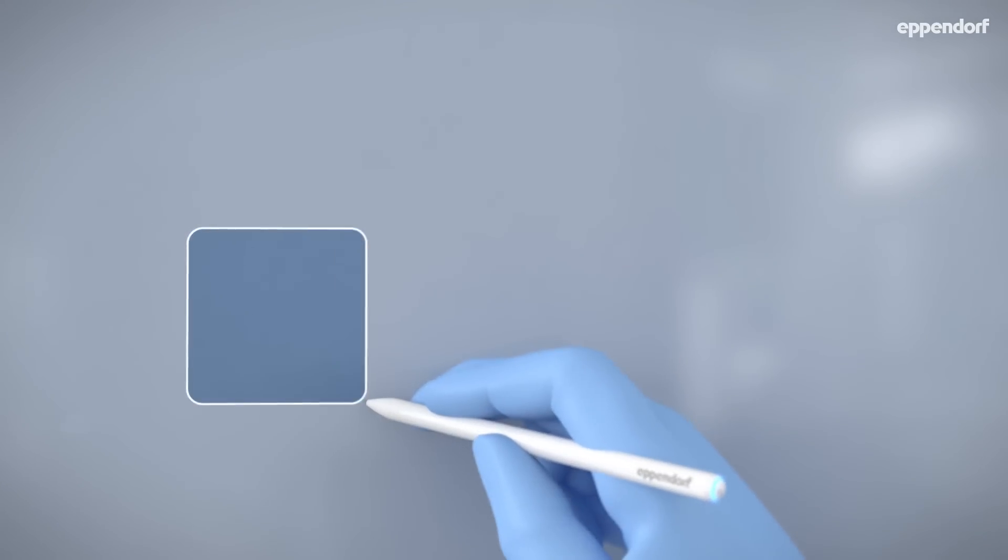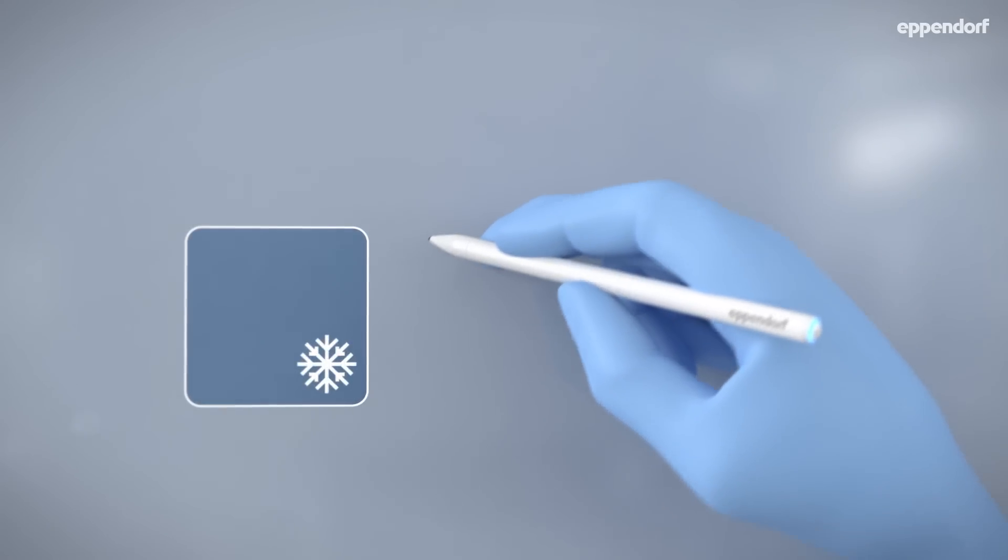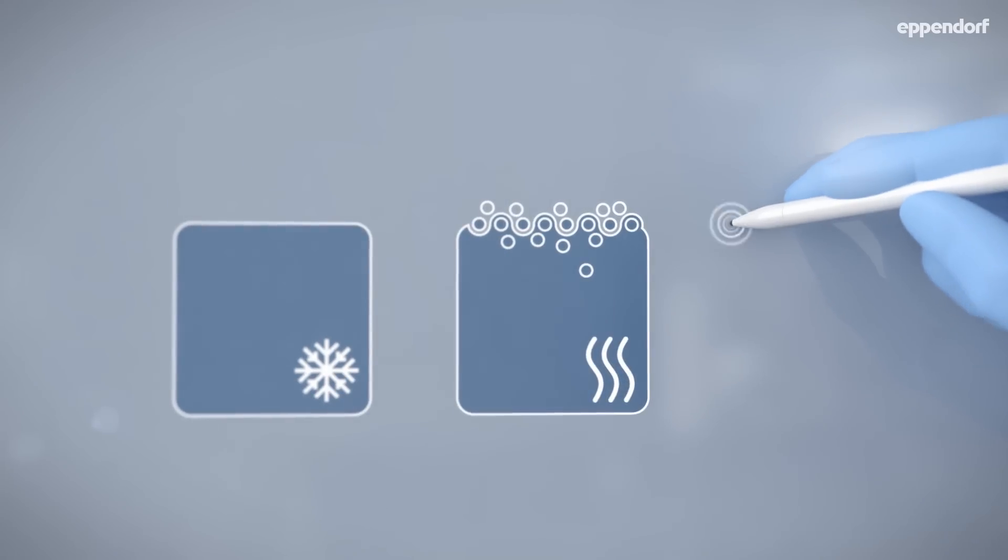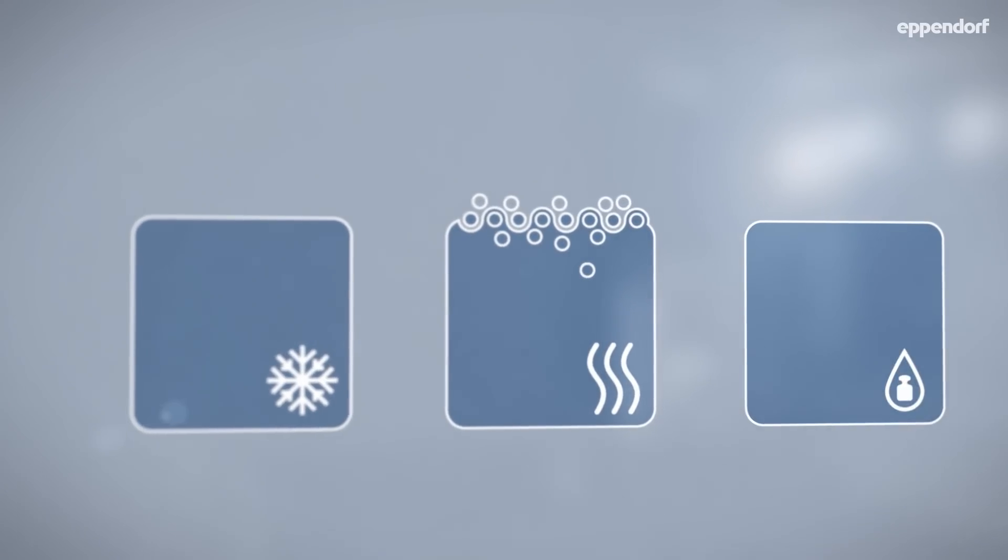With reverse pipetting, you can greatly improve your results when working with problem liquids. Let's look at three categories of problem liquids and see how we can minimize the problems they cause.